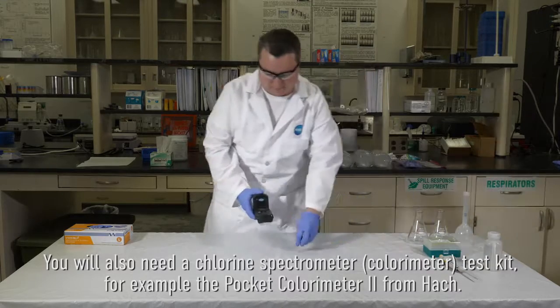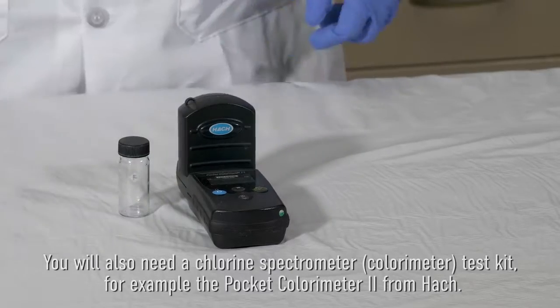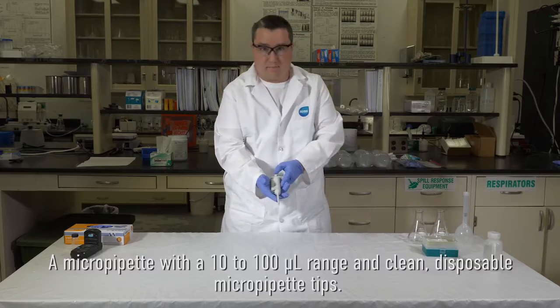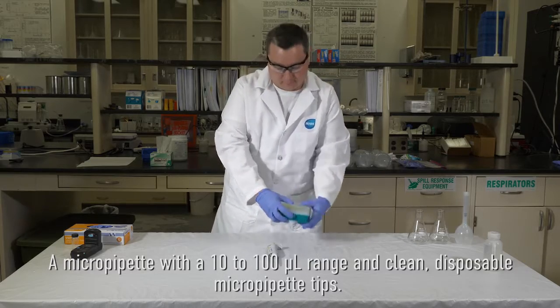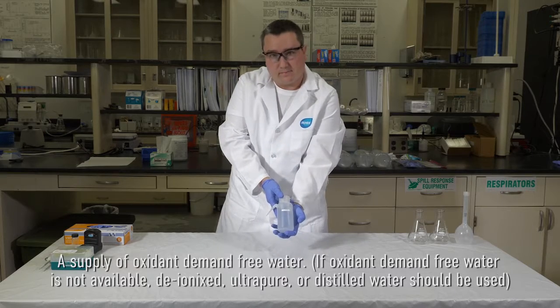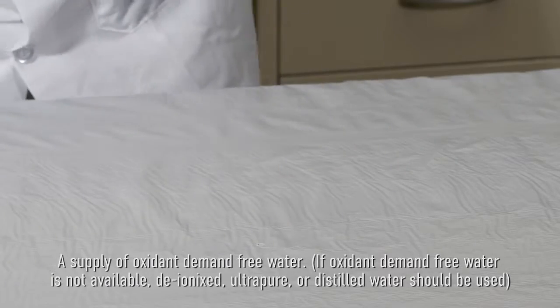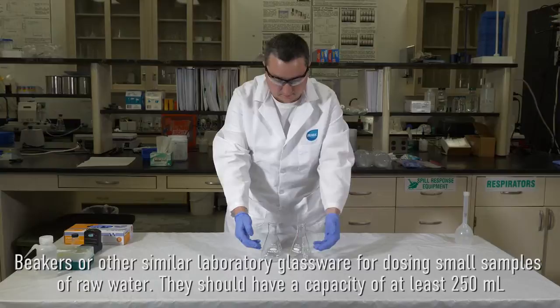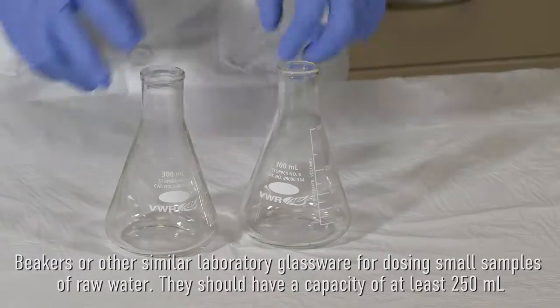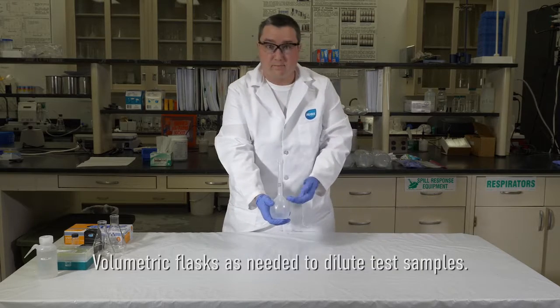A chlorine spectrometer or colorimeter test kit, for example, the Pocket Colorimeter 2 from Hach. A micropipetter with a 10 to 100 microliter range and clean disposable micropipette tips. A supply of oxidant demand-free water. If oxidant demand-free water is not available, deionized, ultrapure, or distilled water can also be used. Beakers or other similar laboratory glassware for dosing small samples of the raw water. These beakers should have a capacity of at least 250 milliliters. Volumetric flasks as needed to dilute samples.